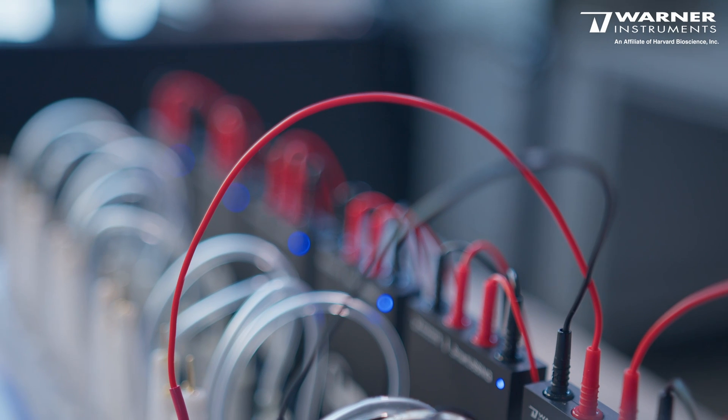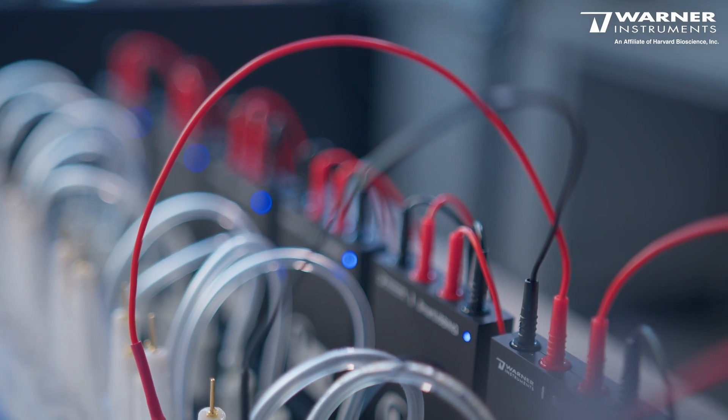This reduces the size of the setup and makes it more movable. It also allows us to reduce the length of the cables towards the amplifier, which reduces the noise of your recordings and improves the quality of your data.